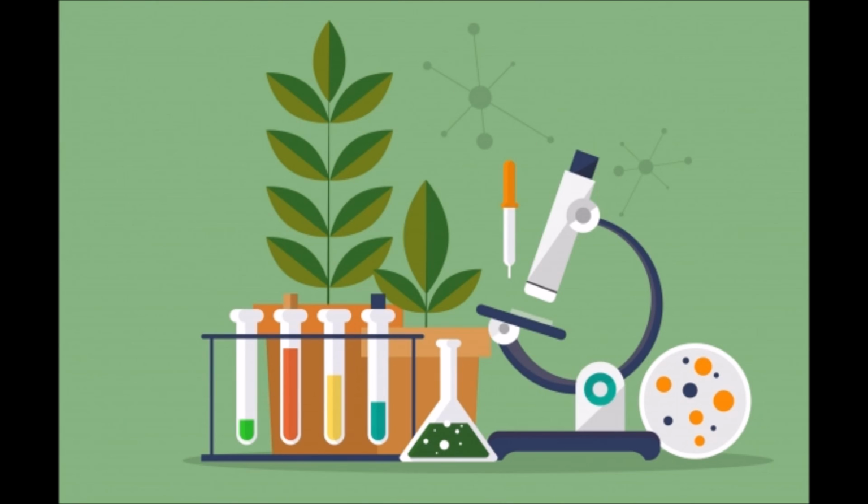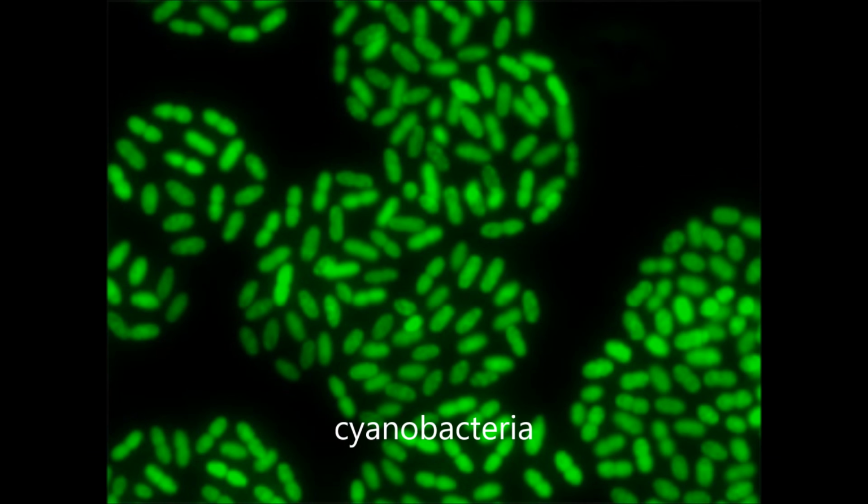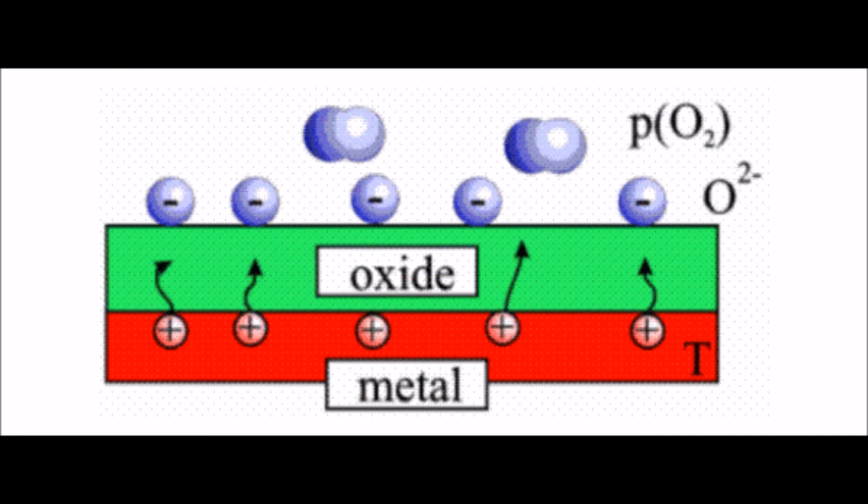A biological application includes studying the presence of free radicals in healthy and diseased tissues with ESR. In photosynthesis carried out with photosynthetic bacteria, the oxidation of the bacterial chlorophyll in vitro produces an ESR signal. Within the study of inorganic compounds, ESR is used to study catalysts and used in determination of oxidation states of metal.